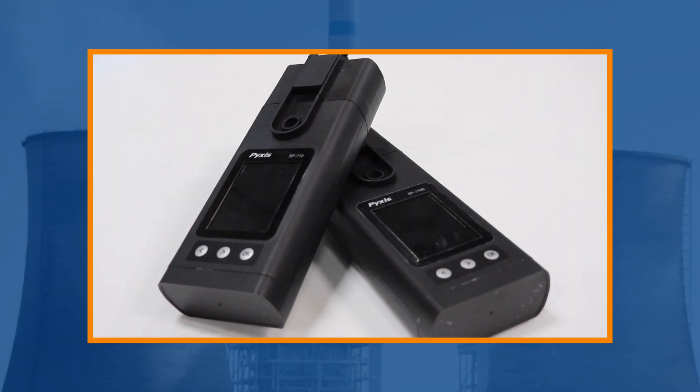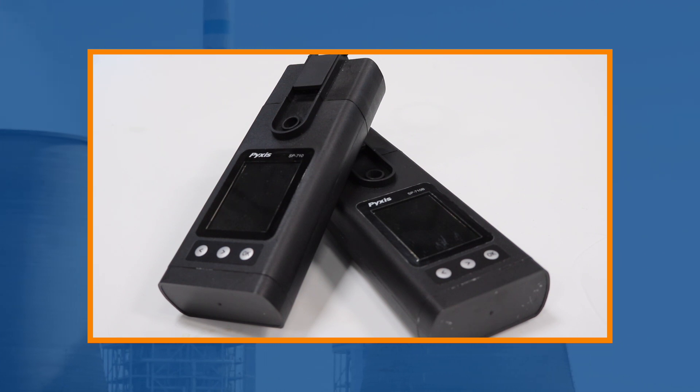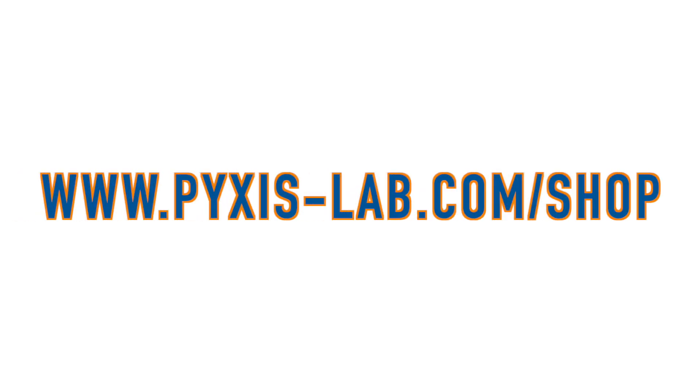These innovative handheld multimeters are durable, waterproof, drop-resistant, and fully prepared for rigorous and dirty water treatment applications with the highest degree of accuracy and ease of use. Purchase yours today at pixis-lab.com/shop or with Aquaphoenix Scientific.